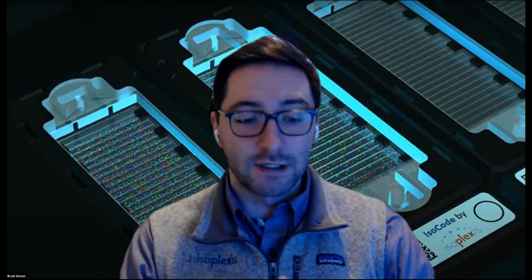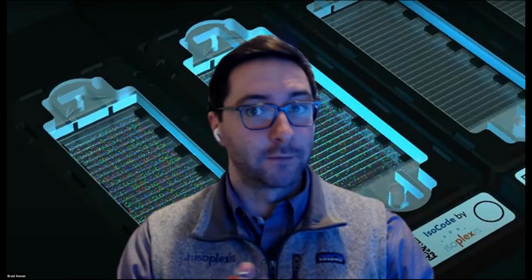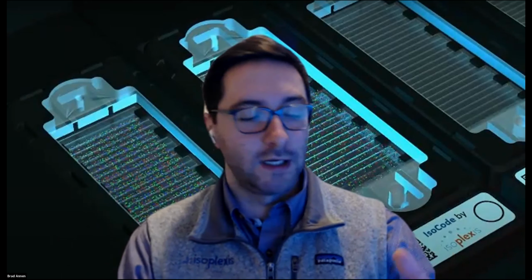So if there are, hopefully, a lot of you interested in this, it may get to the point of saturation on use. Obviously something to explore further down the road if it does get there, but we do have a smaller instrument, the IsoSpark. It is more of a personalized lab instrument, which Cole Sweeney is the instrument rep for Isoplexis for University of Michigan. He can have that conversation if you all are interested in going that route. But for now, there is an IsoLite that is going to act as a shared application for people that are interested.